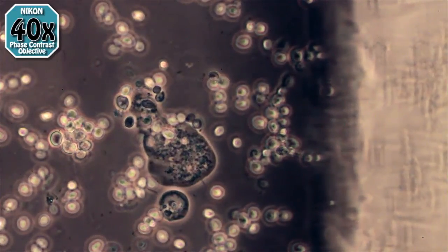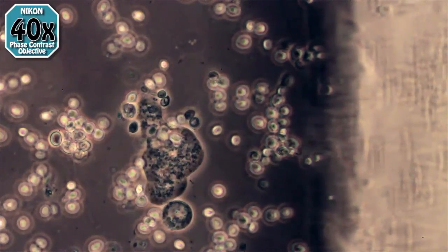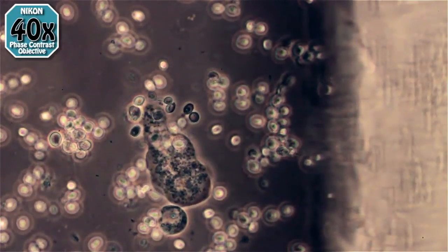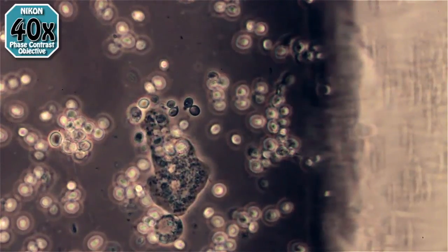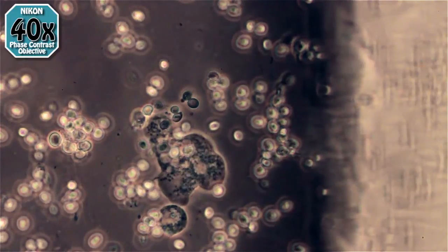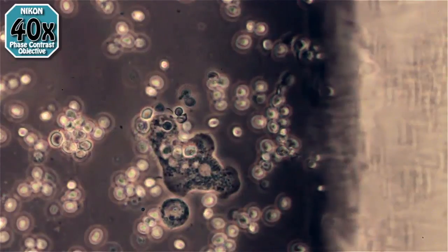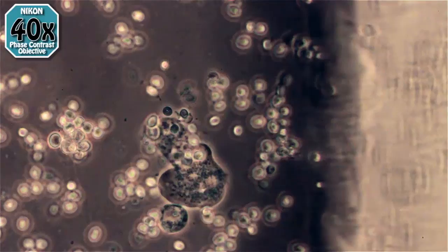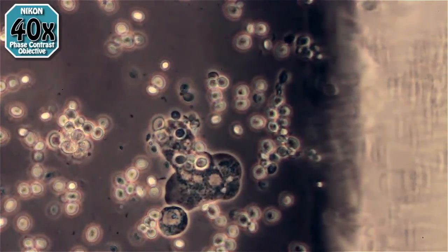This is one of the amoebas in there that's taking advantage of the yeast as a food source. You can see he's got a bunch of them inside of him already. It also seems that for every body length or two that he motors along, he absorbs a few more inside and uses them as a food source — which is the whole idea. If anybody knows what species of amoeba this is, you could let me know.